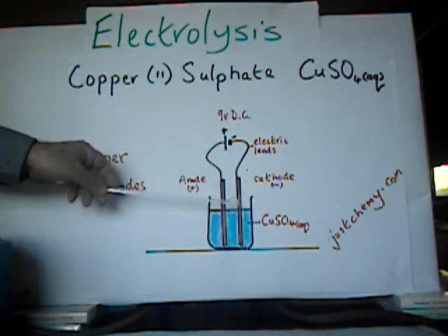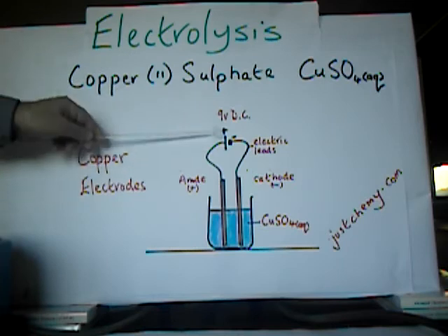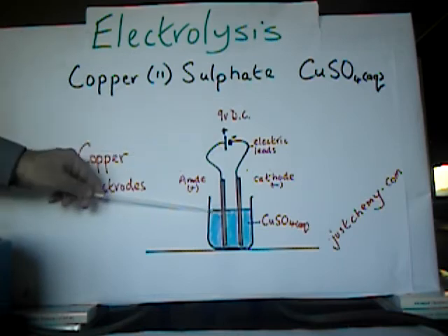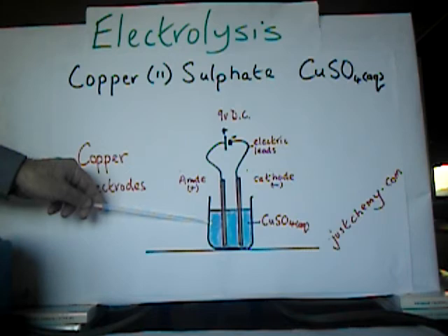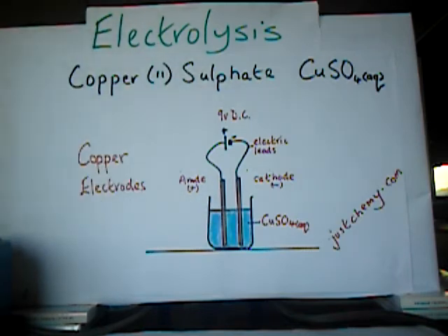We have copper electrodes dipping into a solution of copper sulfate. And on the left here, this is the electrode connected to the positive terminal. So that's the anode. And over here, this is the cathode. Both electrodes are made of copper.